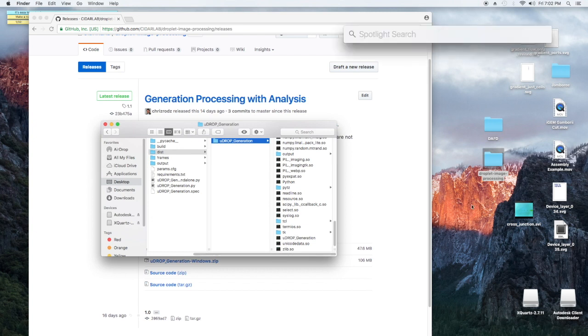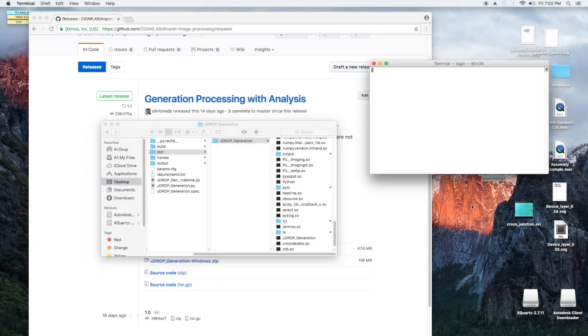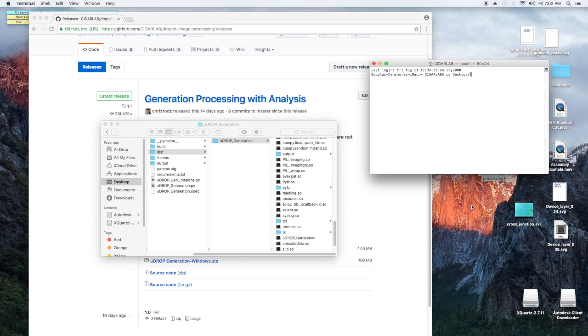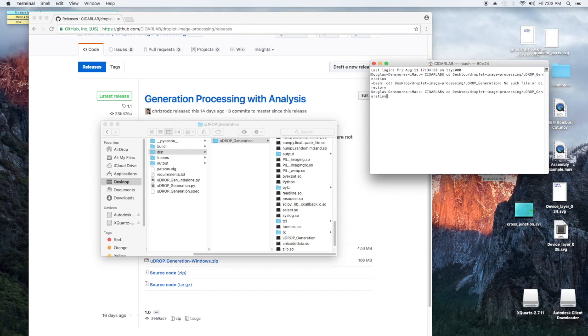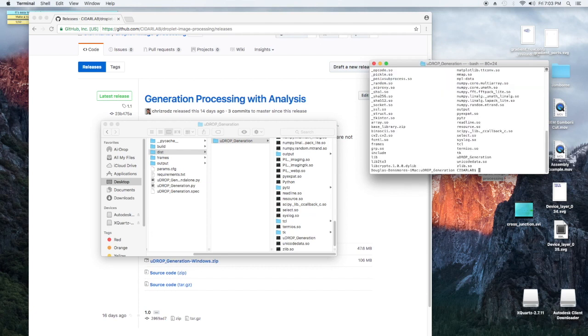So let's get to use it. I'm going to open up Terminal. If you're running Windows you're going to be opening up your command prompt, and I'm going to go to its location. So it's on desktop, Droplet Image Processing, Udrop Generation. Let me get to it. Oh I'm sorry, dist, and then Udrop Generation.